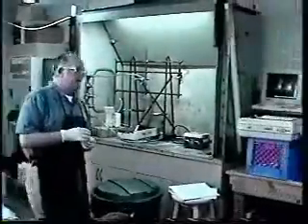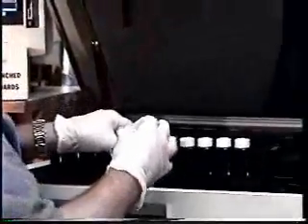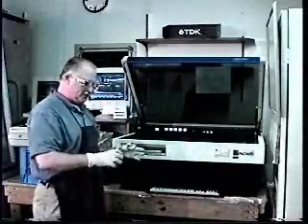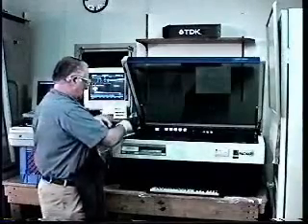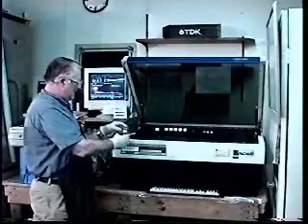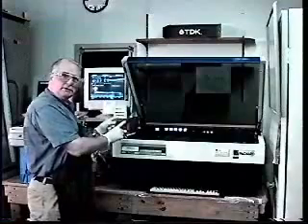Okay, let's put this in the liquid scintillation counter. This apparatus has an elevator in the back that pulls the sample down between two opposing tubes that look at this vial. There'll be one tube on one end, one on the other, and it's encased in lead to minimize the background radiation. And when both of these tubes see a flash simultaneously, then that's the count.